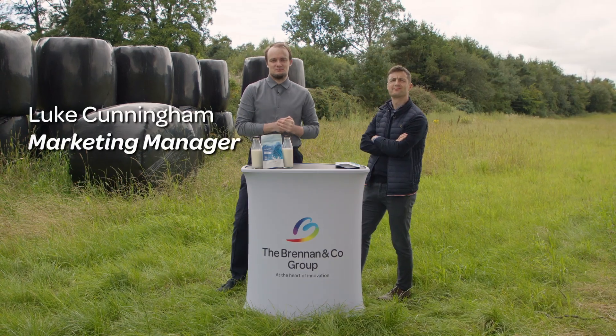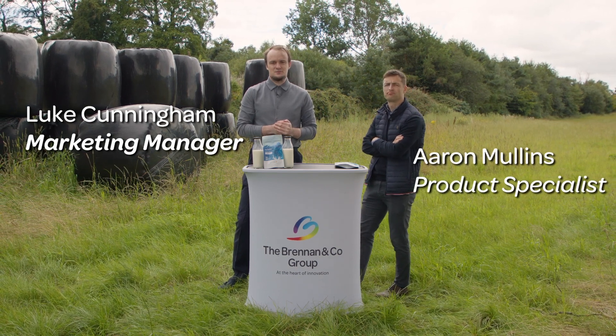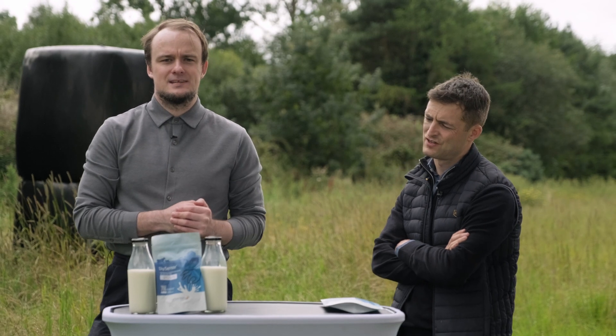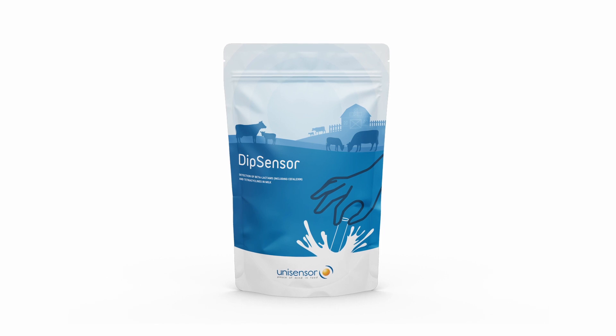Hi there, my name is Luke Cunningham, the Marketing Manager at Brennan & Co., and beside me is Aaron Mullins, the Food and Dairy Product Specialist at Brennan & Co. Today we'll be taking you through a quick step-by-step guide on Dipsensor, the quick easy-to-use milk test from Unisensor.